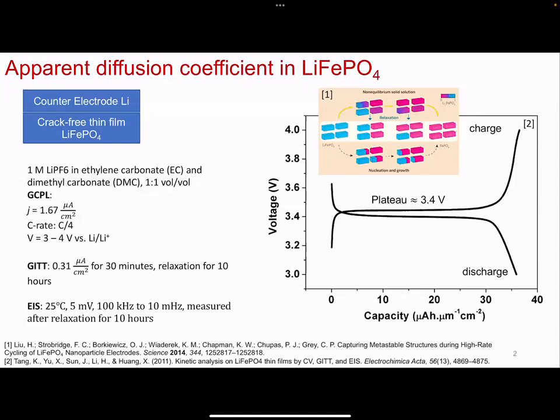So we'll talk about all of that, but we're going to review this plot here and look at, okay, if you have lithium iron phosphate, what you expect is a 2-phase transformation. Now you can bypass that. So this is not the voltage curve for fast charging. This is for standard, like C/10, C/4 even.